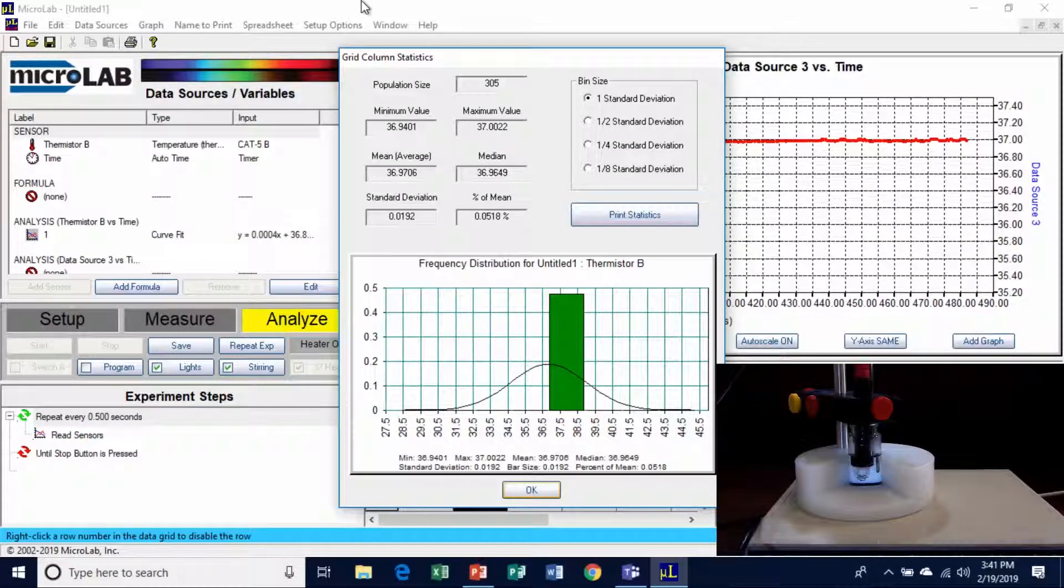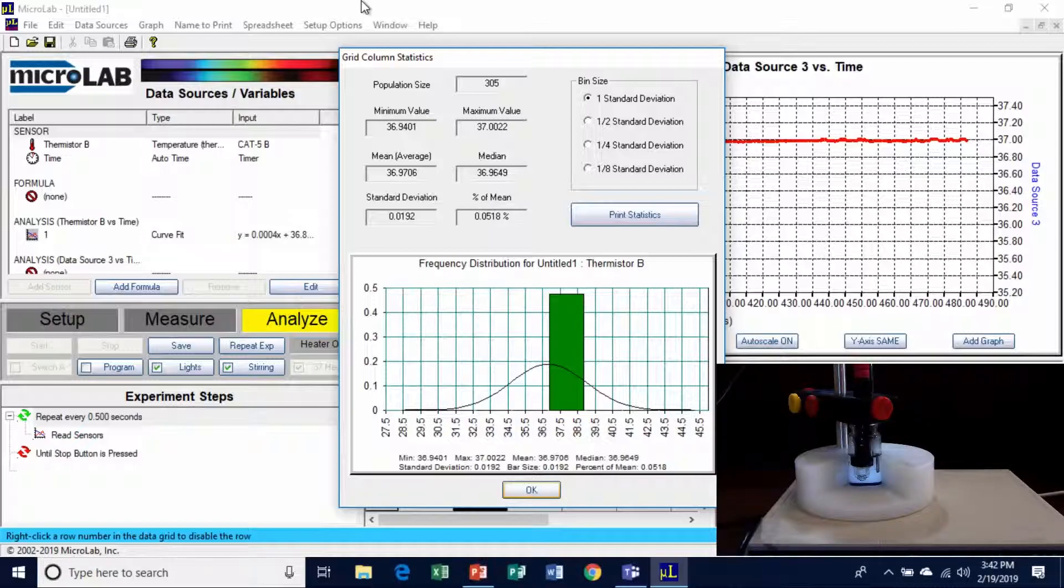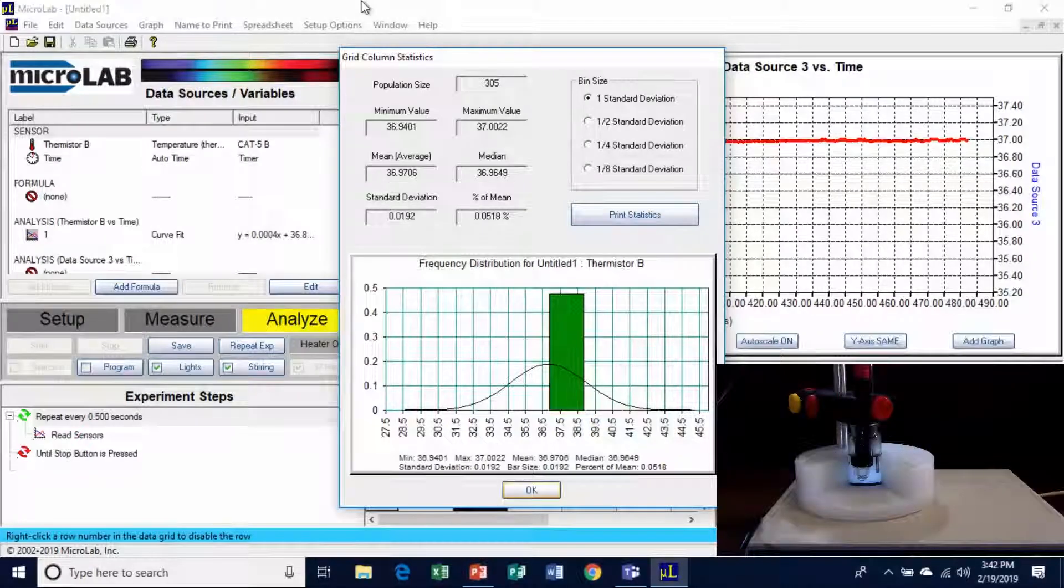This is a very, very stable way to control temperature to any target you want up to about 60 degrees. This one you could do a body temperature experiment for kinetics. And it'll be right on the money every time. Ladies and gentlemen, come play again.